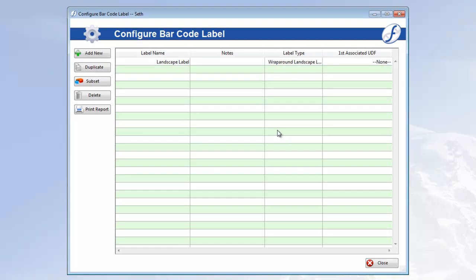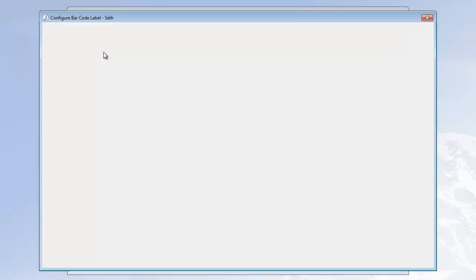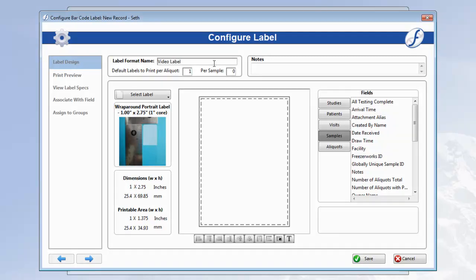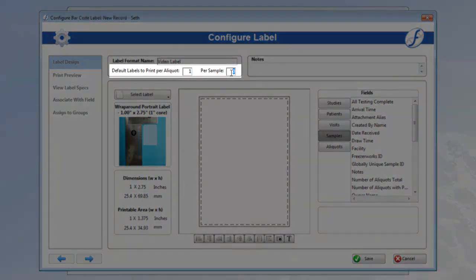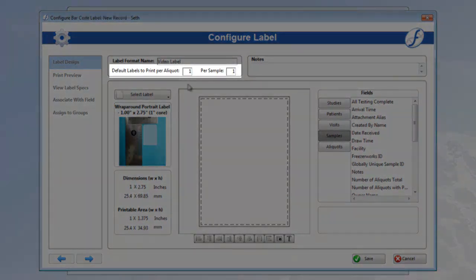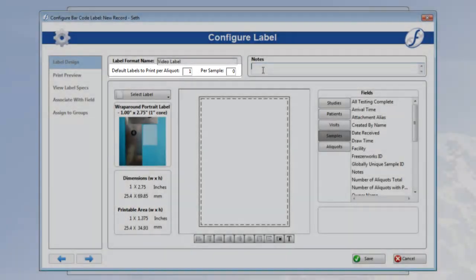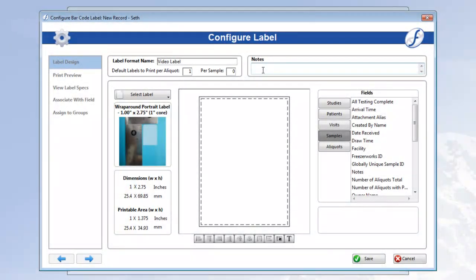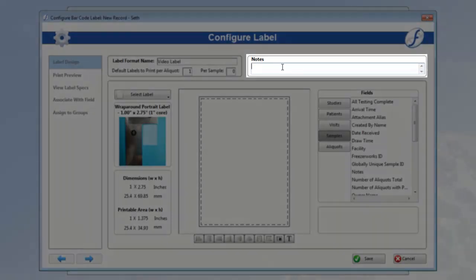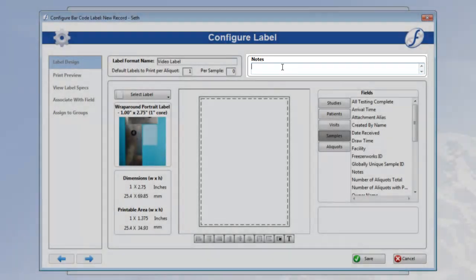Click Add New to create a new label format. Start by giving your format a name. Then you should determine whether you want to print this label for samples or aliquots, and how many of each. This is only a default setting, and can be changed at any time during printing no matter what. If you'd like, you can also include any notes you find important for future users.